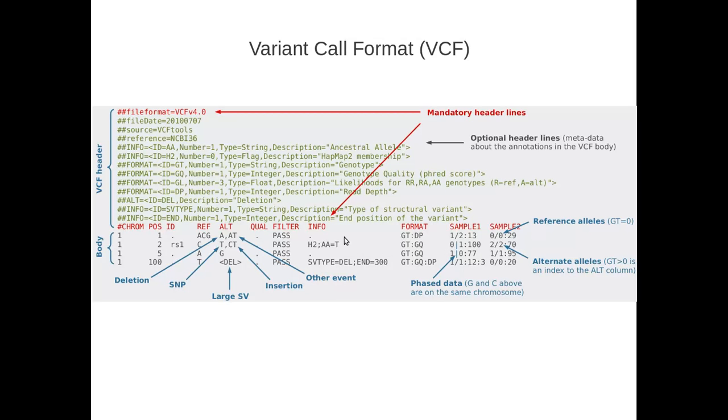And so I guess the final thing I'll say, I did forget the info column. It basically contains information about the variant, or the entire record. It oftentimes includes the depth. VCF is very flexible, so the info column doesn't have requirements per se. You'll see people include different types of information, but as you go through the homework, you'll see the different types of information that the GATK by default dumps in the info column in its SNP calling. Okay, so that's all I wanted to say about that.